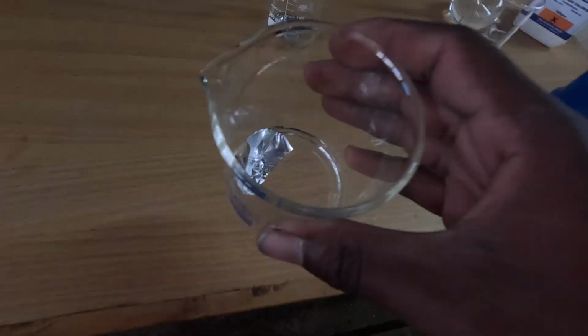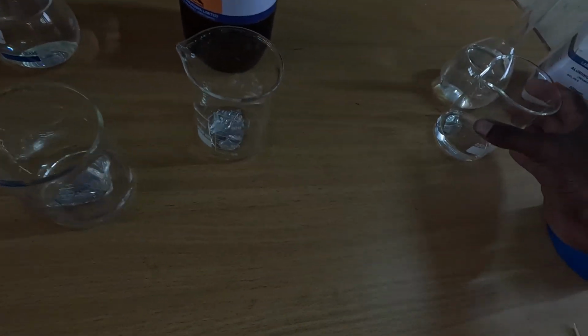So you can see it is reacting with the floor. So this is sulfuric(VI) acid, but it is not reacting with aluminium. I'll take nitric acid, which has not reacted here, and pour it down. You are seeing it corroding the surface there, but inside here it is not reacting with our aluminium.